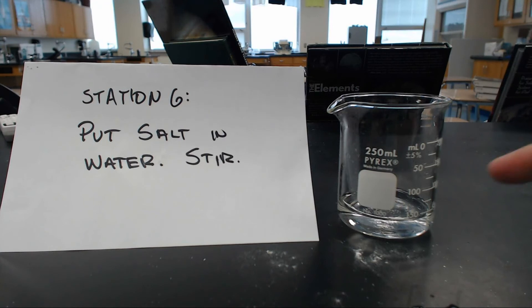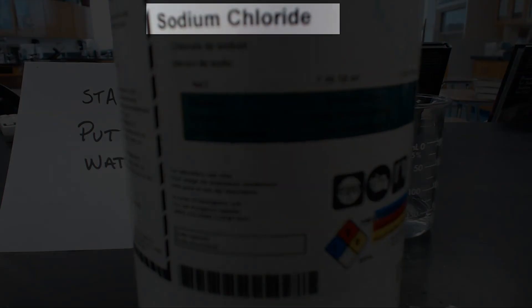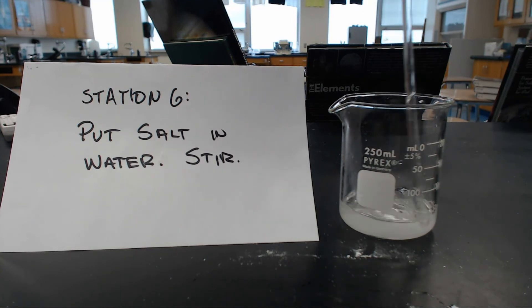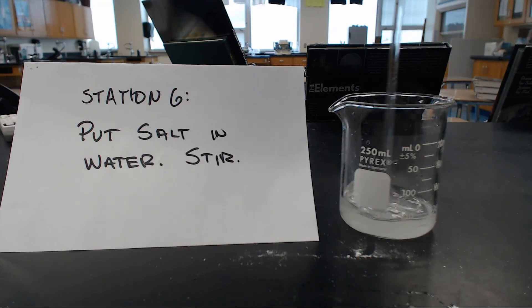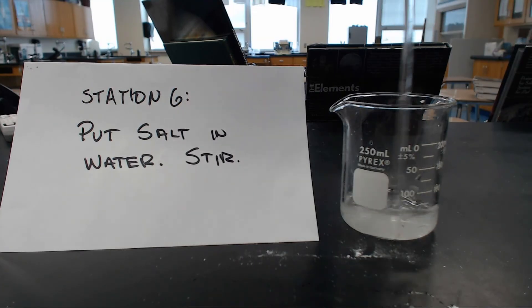So station six: you take water. I have a little bit of water in this beaker at the bottom. And then again, I have salt, which is sodium chloride — you can see right there it says sodium chloride. I'm going to take a little bit of salt and put it right in this beaker. Then the whole idea is to stir it. I'm going to take my glass stir rod and stir this around. And voila.